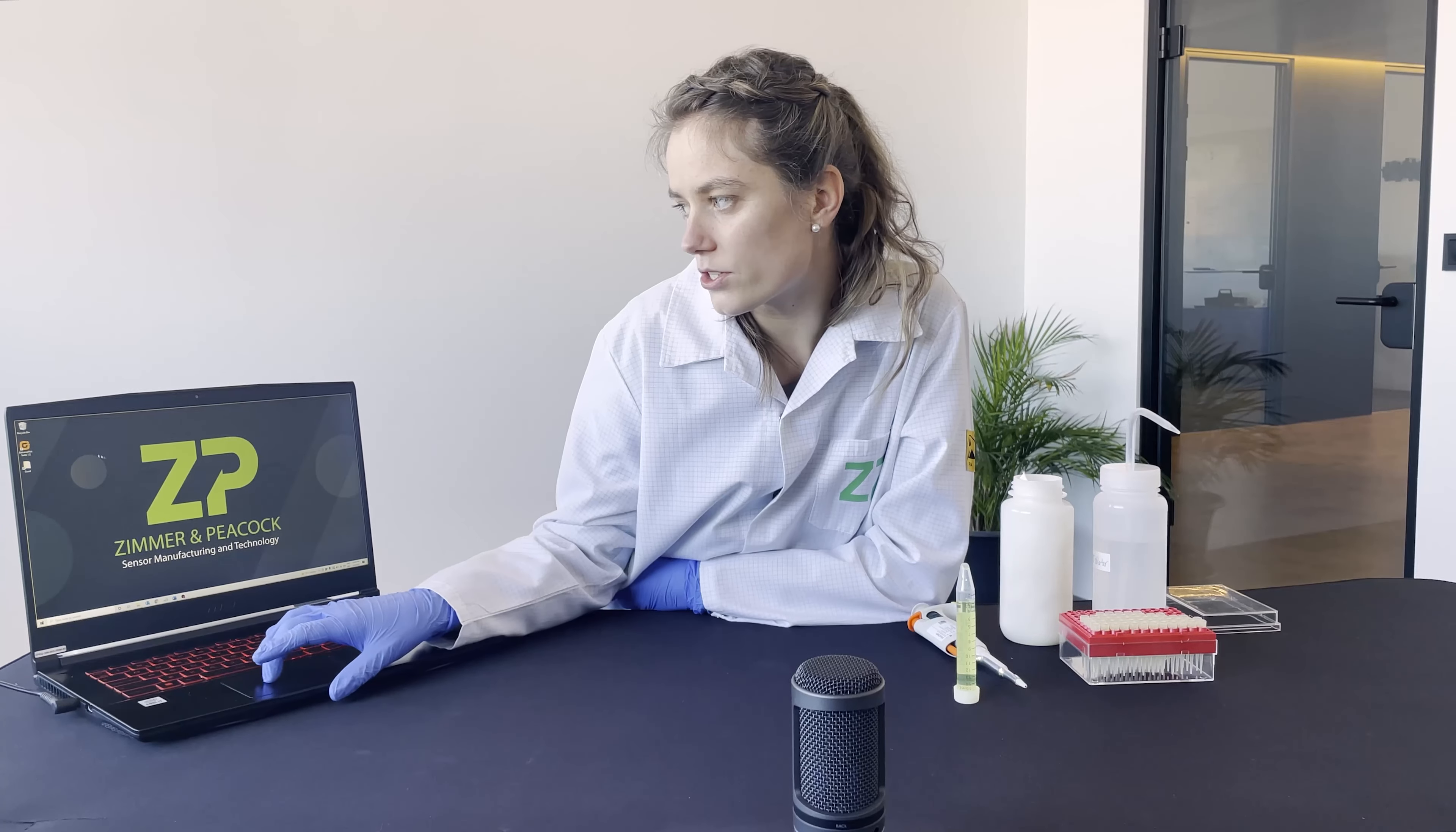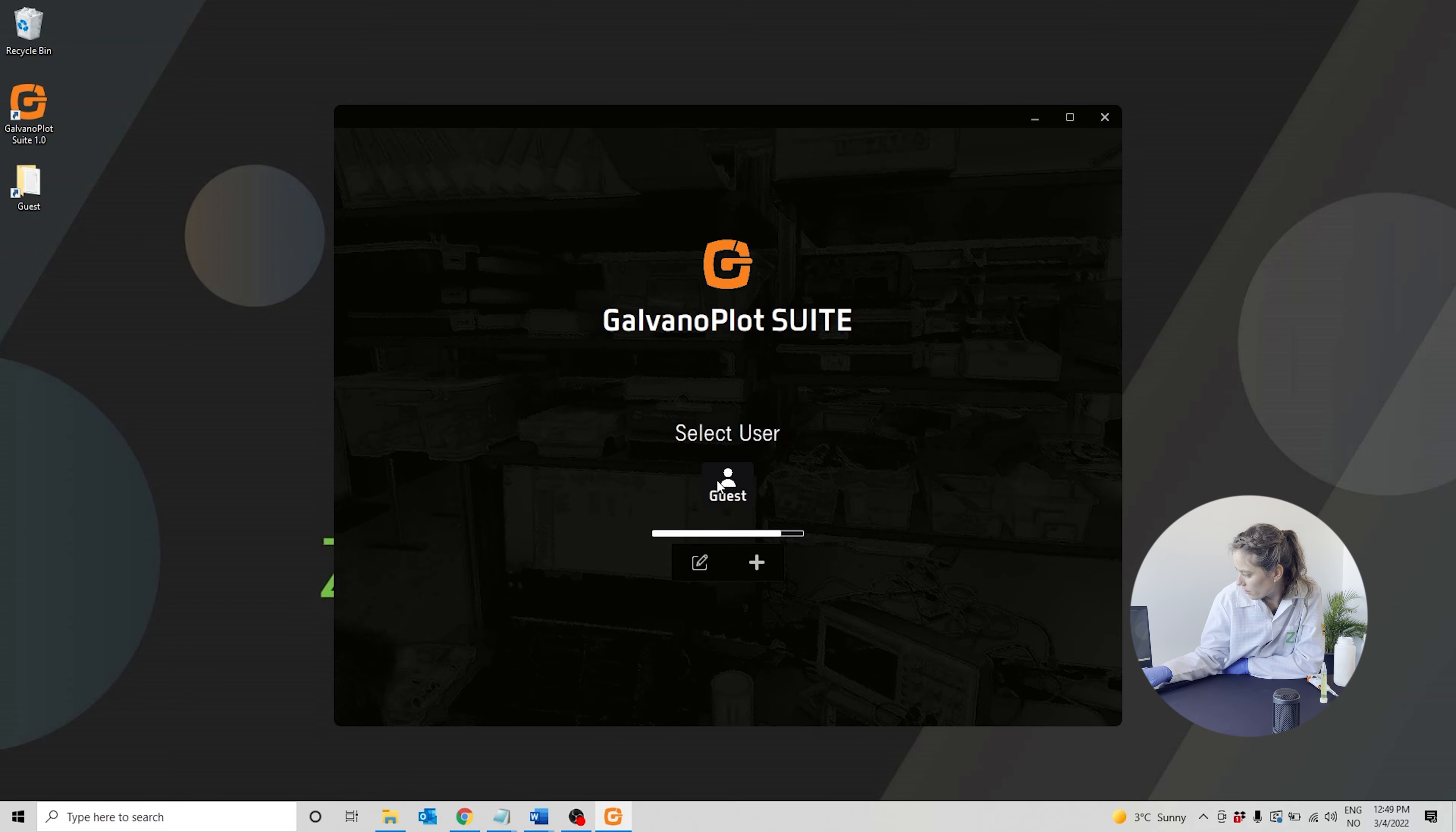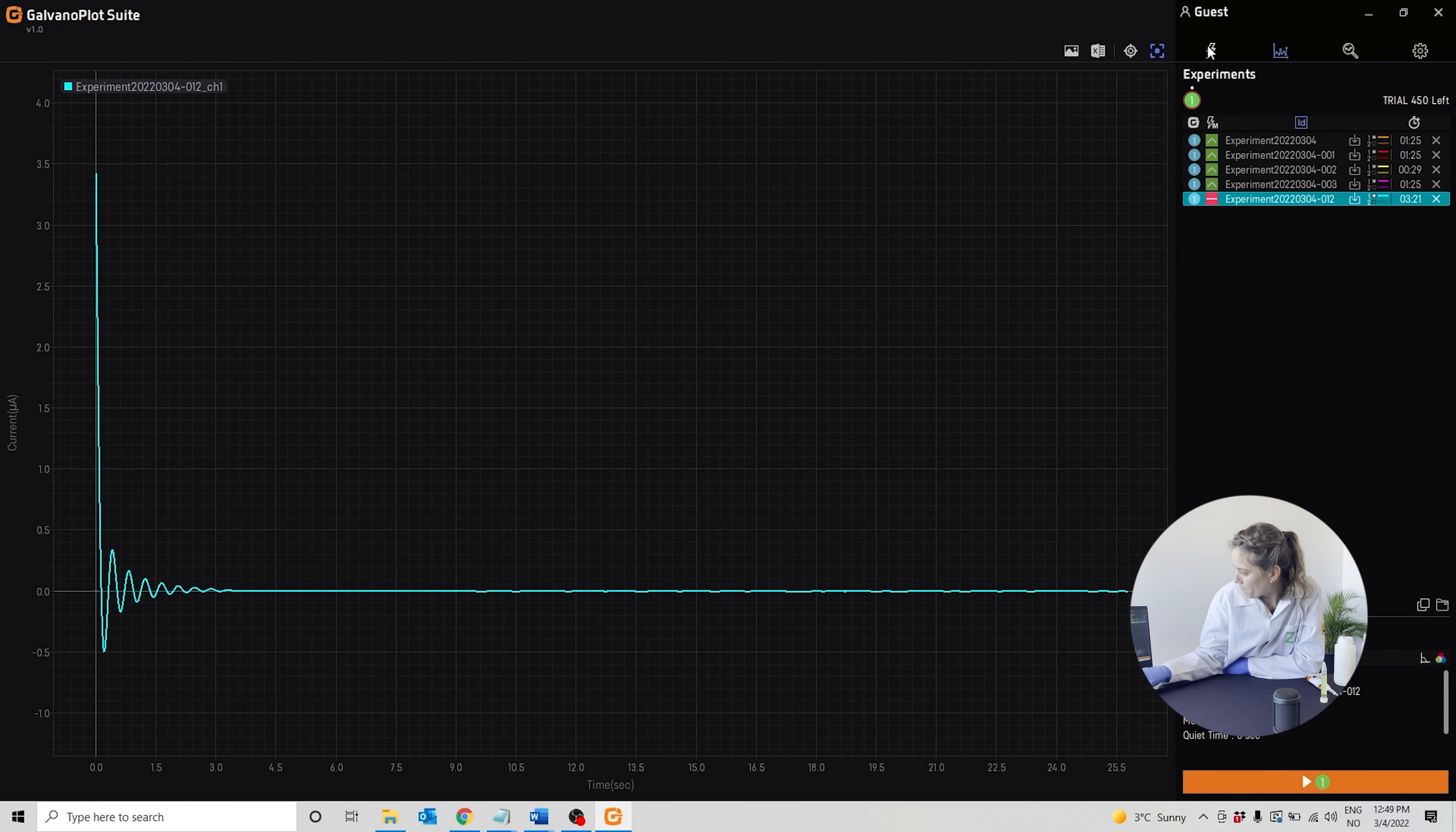We will start the software program, GalvanoPlot, and log in as a guest user. Right now it shows one of our old measurements, but we'll choose new experiment.